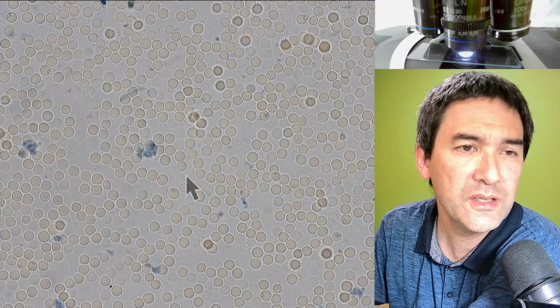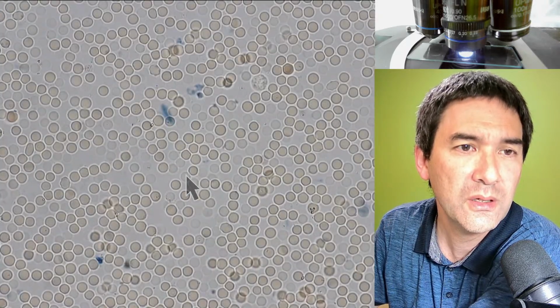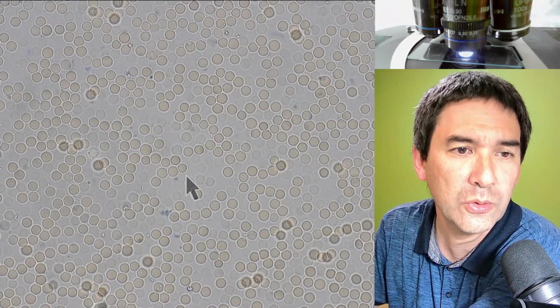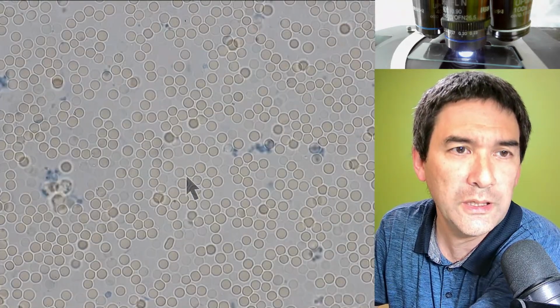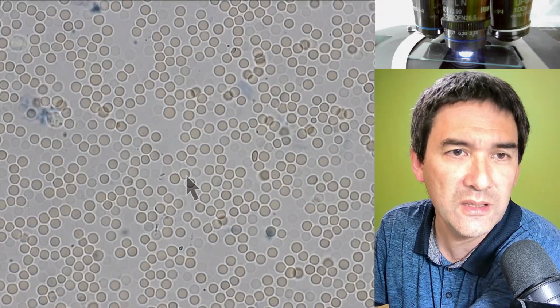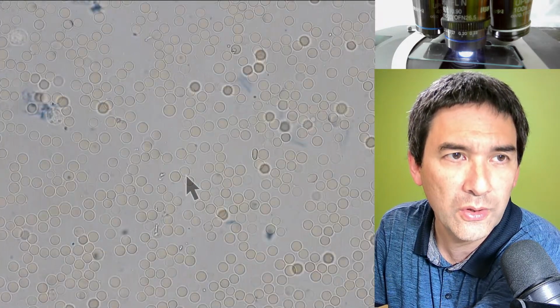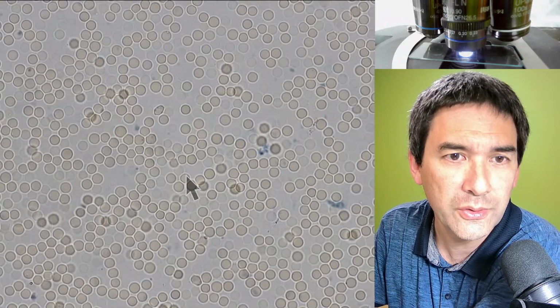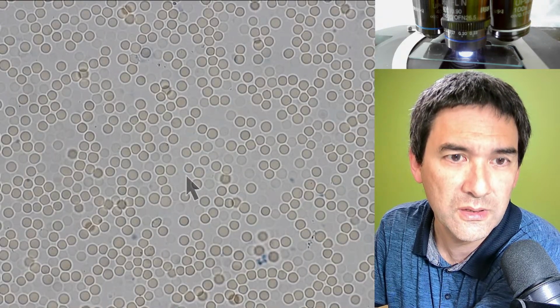And the other things that you see here are too big. I think we come to the conclusion that probably the blue fountain pen ink is not the best stain to be used for staining blood, at least the white blood cells.